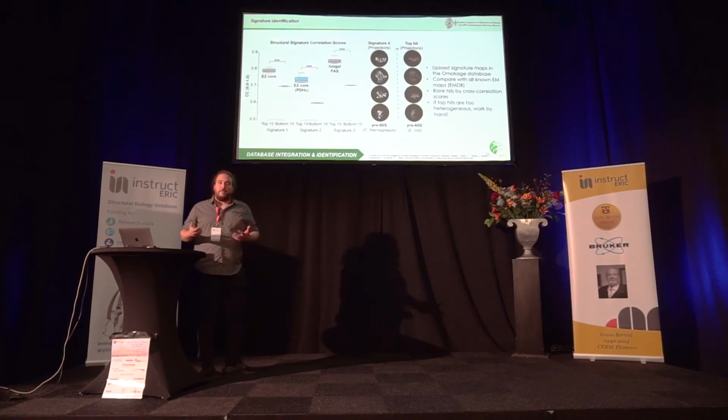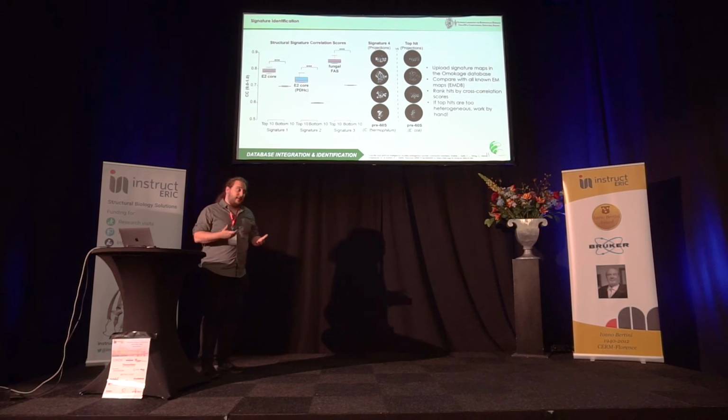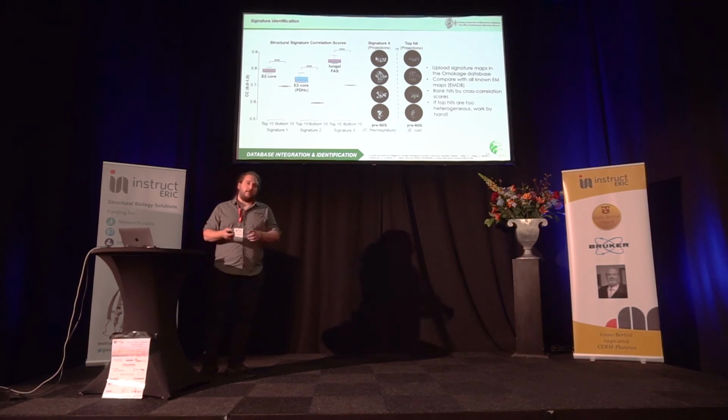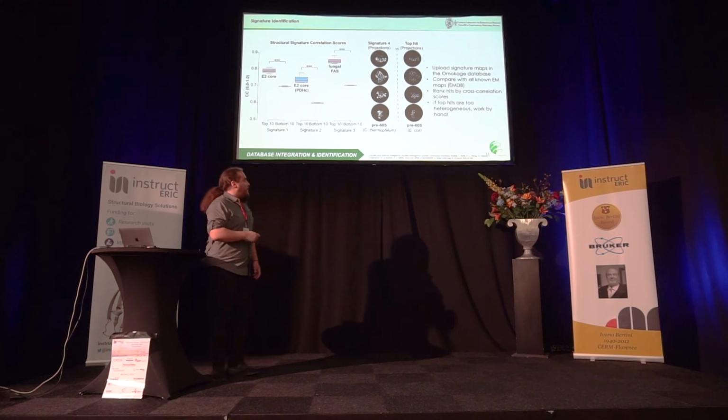And now we have the tough job to identify what the signatures are. As we're using a cell extract, we're not always sure what exactly is in there. This is why we do mass spectrometry to identify the in-fraction content. Then we have another step that we can combine with to narrow down our possible targets.